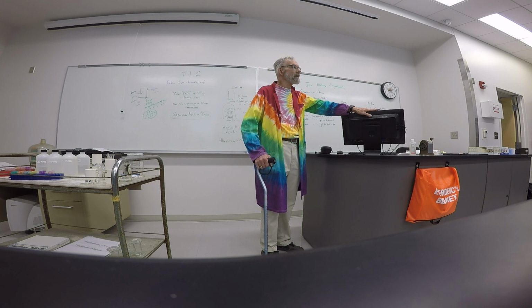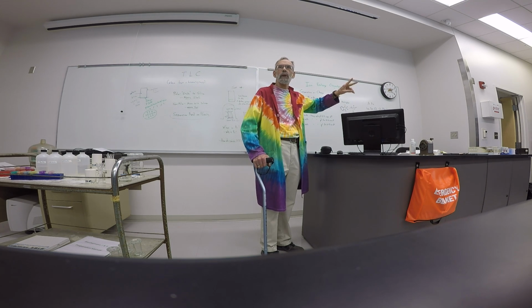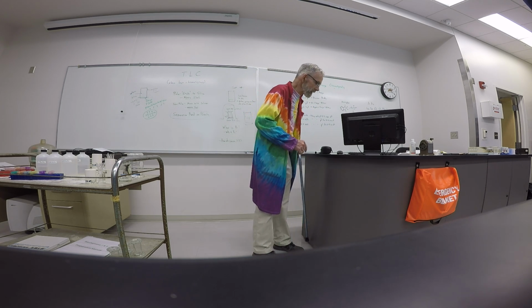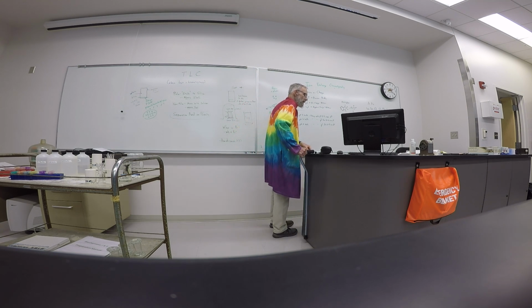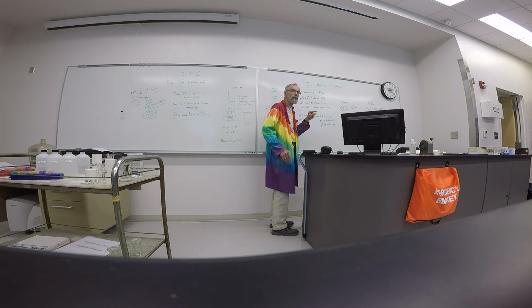The reason I'm asking this is I want to see, did anybody find in the manual any reference to that question? Because I'm not sure whether it was a fair question or not. No, it wasn't. There wasn't a reference. The proper answer here is supposed to be that the BSA should not react as much.